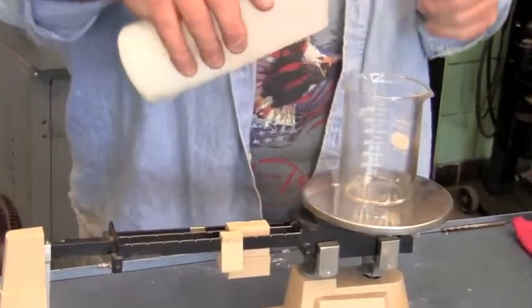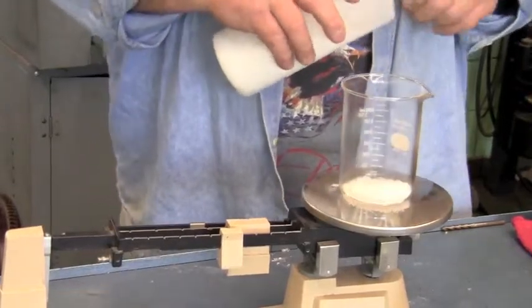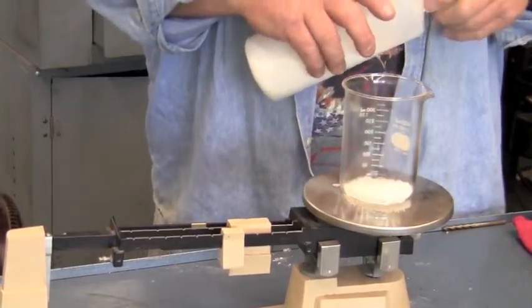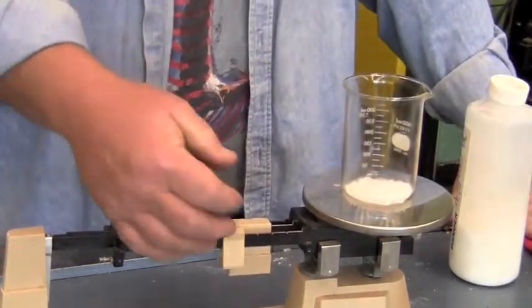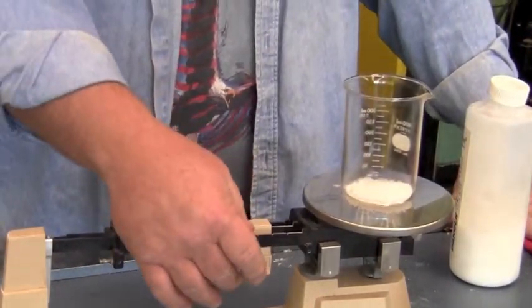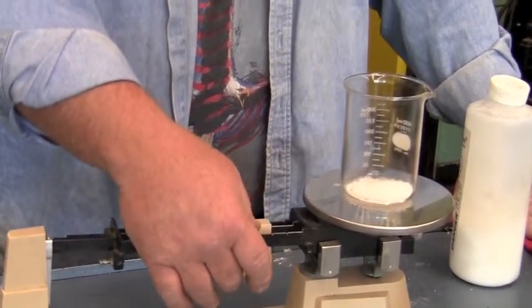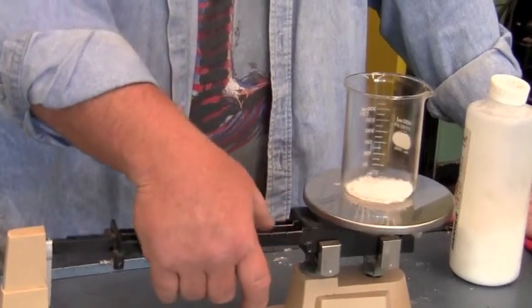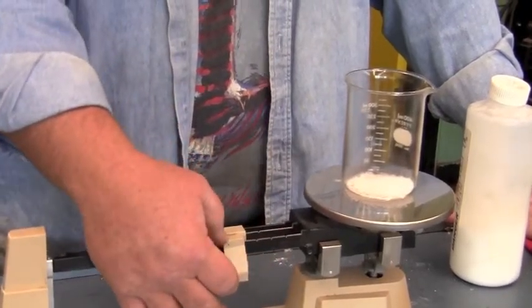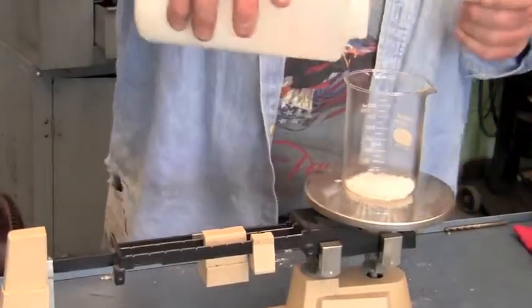So we're doing 10 liters of oil, so we need 80 grams. I need to adjust this — we're at 146, so I need to make this 226 to get the 80 grams.